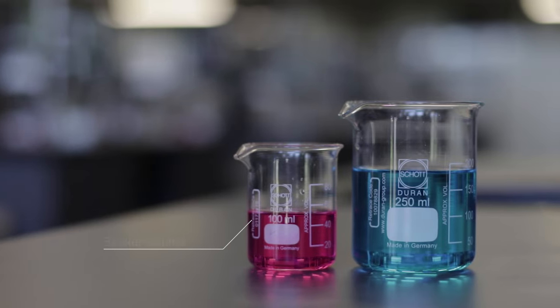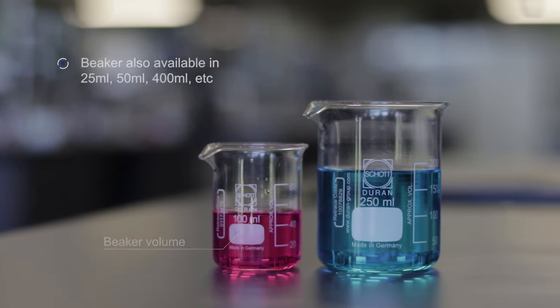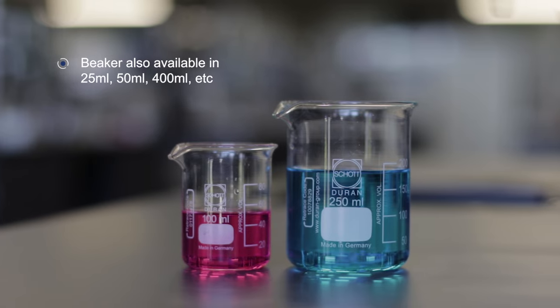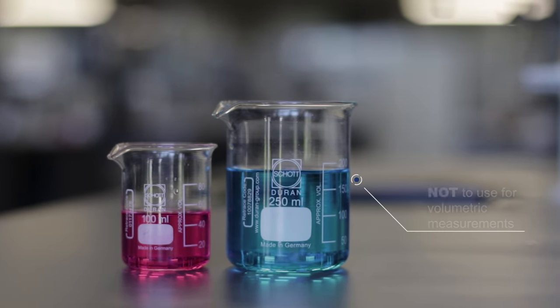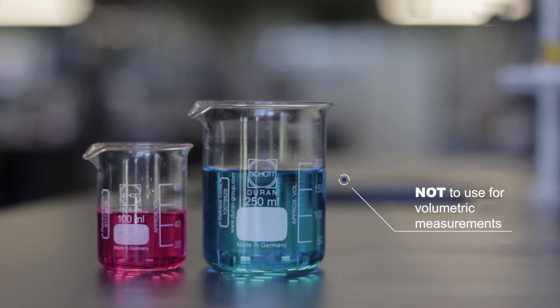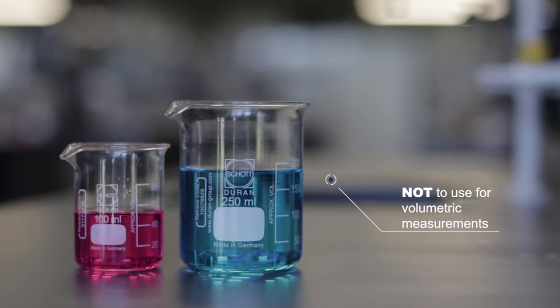A beaker has a cylindrical shape with a flat bottom and is available in a wide range of sizes. A beaker is used for stirring, mixing or heating liquids and is not used for precise measurements.